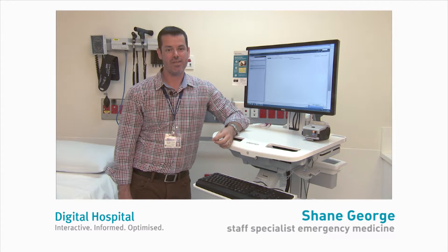My name's Shane George. I'm a staff specialist in emergency medicine and today we're going to have a look at specimen collection using Cerner PowerChart.